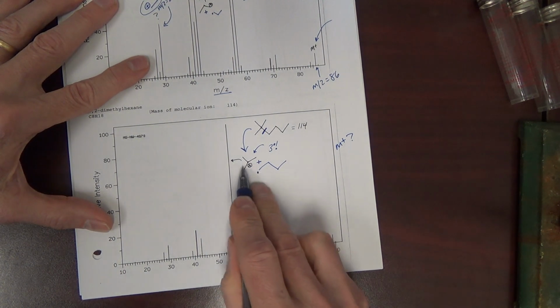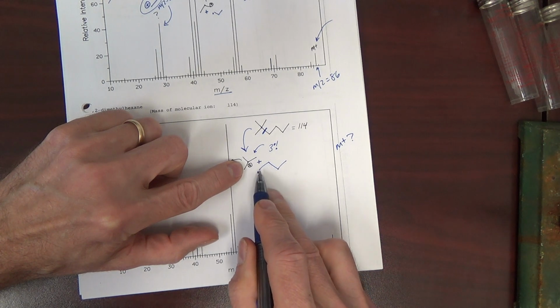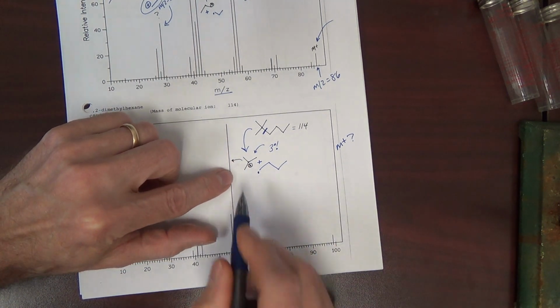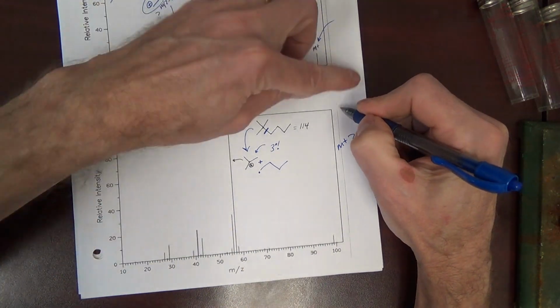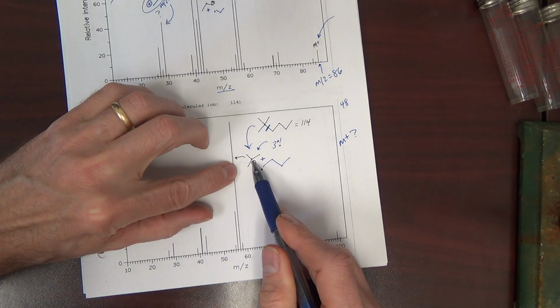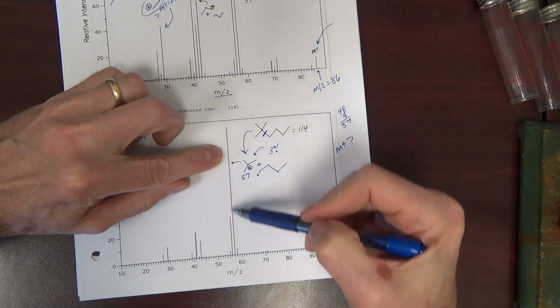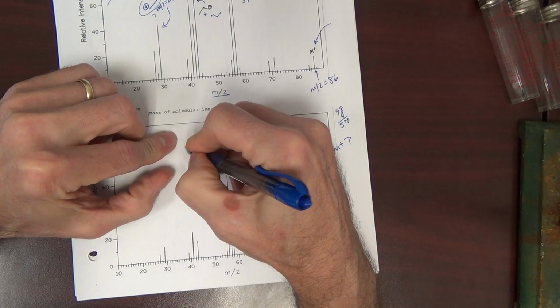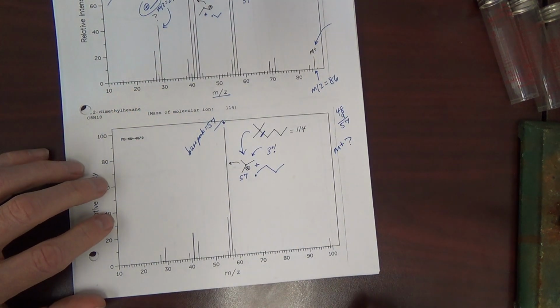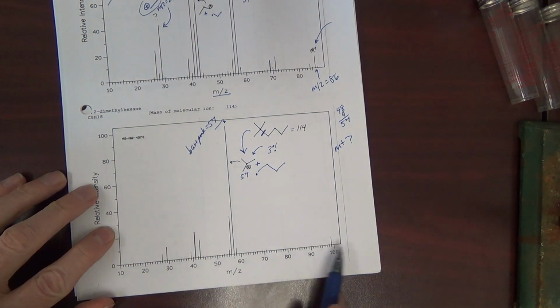What is the mass of this? Sometimes you can get the mass by saying, hey, it lost 15. If this loses 15, that would be 99. It might be just as easy to add this up. Okay, this is 4 carbons. 4 carbons is going to be 48. Now we have 3 H's on here, 3 H's there, 3 H's there, and no H there. That's 9. That's 57. So this is 57. And indeed, it gives a peak at, guess what? Right there, 57. Okay? And that's our base peak. We would expect that to be the base peak because we would expect this thing to cleave to give a nice tertiary cation. It can cleave other places, but those are not as likely.